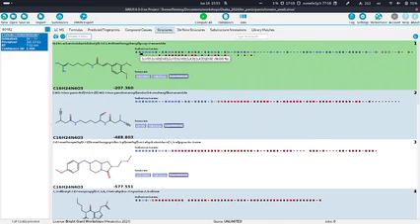The result that we obtain using high-throughput is the same always, because I have to mention that in the past, using SIRIUS 5, we noticed that it is different for the same compound, the classification assigned for my partner and for mine.